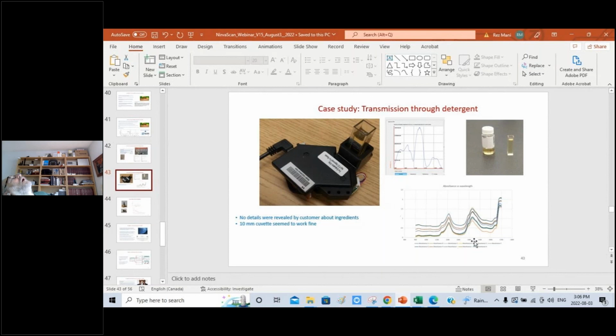I understand this is an issue, but first of all, if you make your own calibration, then there's no problem because you can use the same device to do validation too. But in general, if you have a big model and you want many people to use it, then we need to make a model by averaging readings from 5 different instruments, and that model should be able to solve the problem and be universal. Up until we do that, we cannot guarantee that this would work.